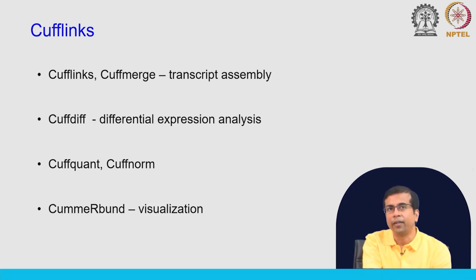Very briefly, here are some functions that you will find in Cufflinks. For example, Cufflinks and Cuffmerge are used for transcript assembly. You also have the tool for differential expression analysis, and different other visualization tools, etc. Again, I urge you to explore through the website.